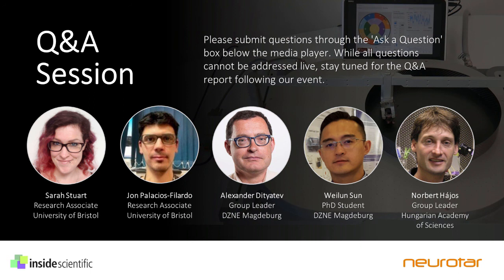Regarding how long you can keep a seal, I would say that it depends on several factors. First, you have the stability of the clamp, of course, which is quite good. However, stability also depends on the size of the craniotomy, since you might see brain movement due to breathing and heart pulsing. This can be minimized if you put some solid agarose plaque to stabilize the brain and the recording electrode. Secondly, stability will also depend on how much the mouse is moving and if those movements occur smoothly.